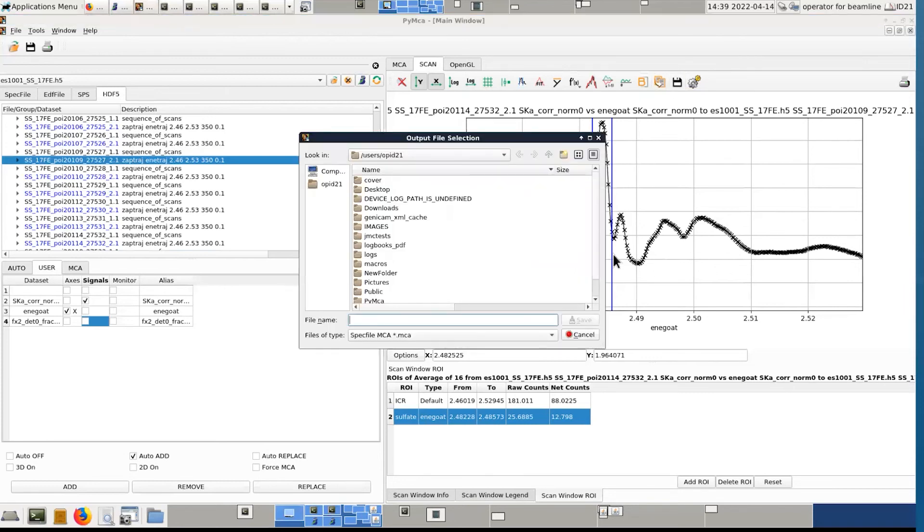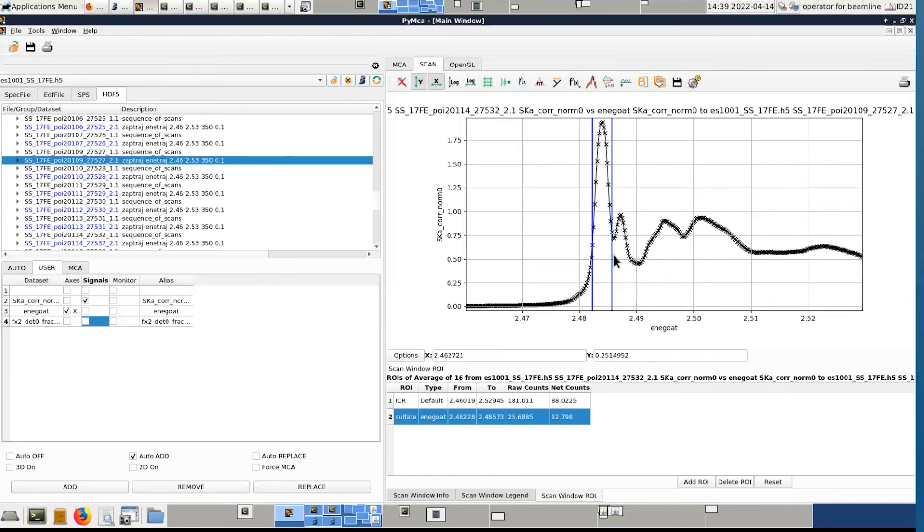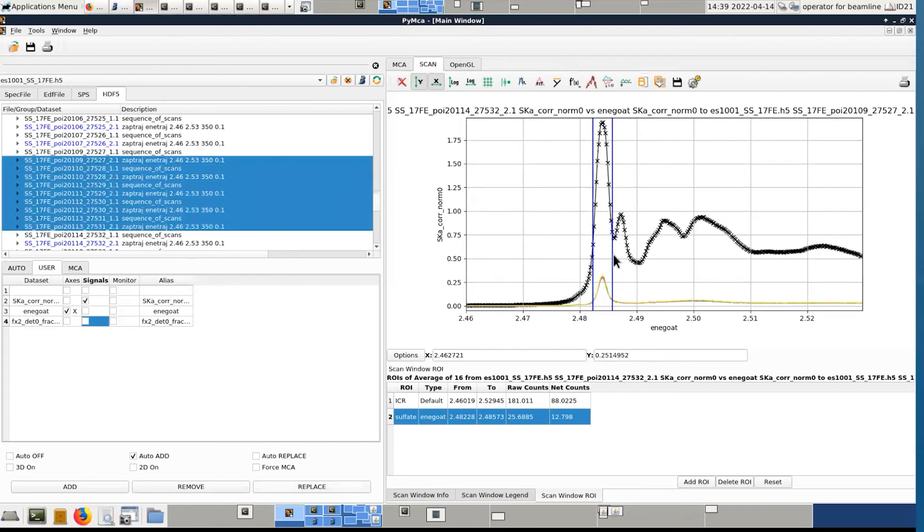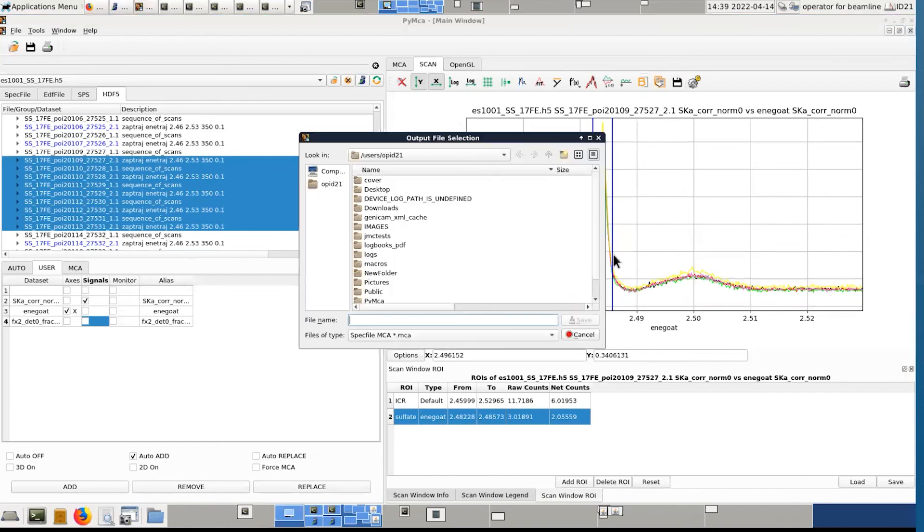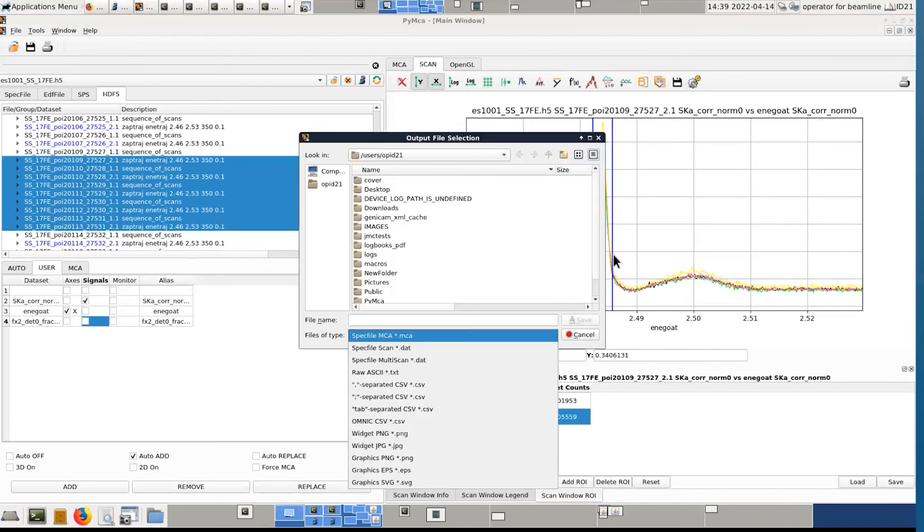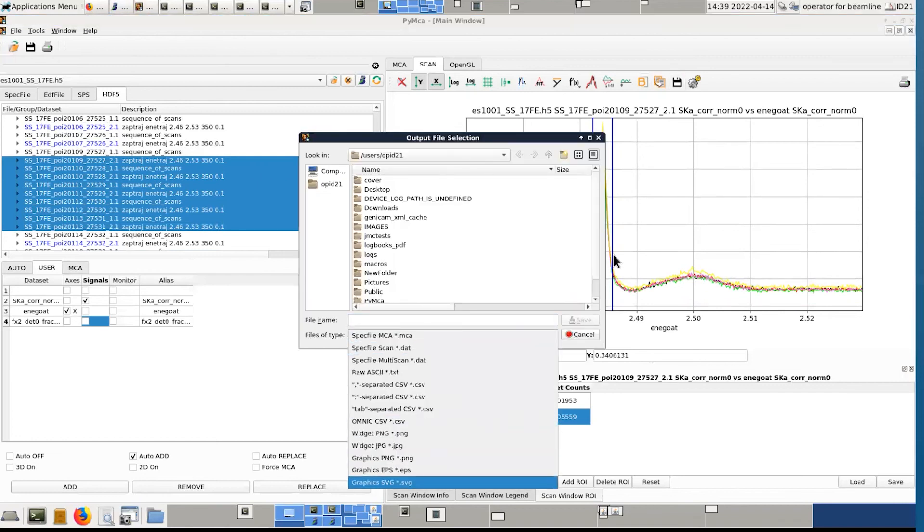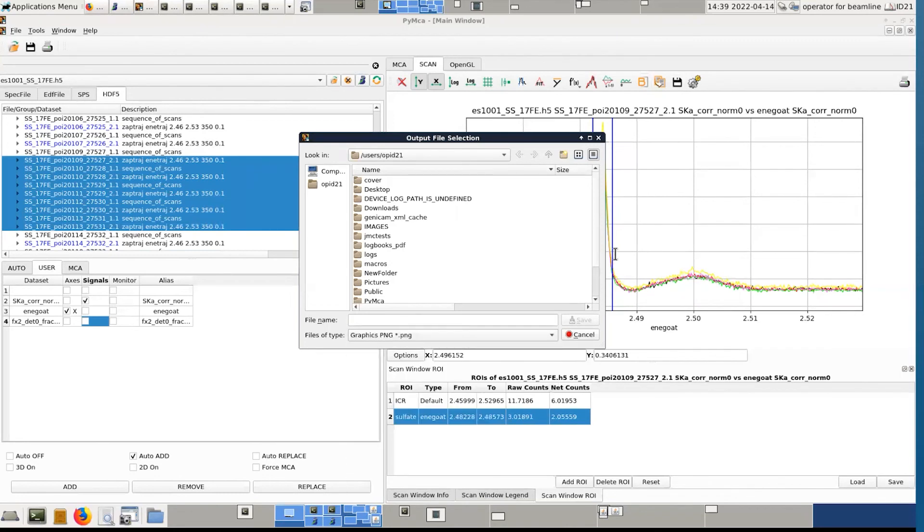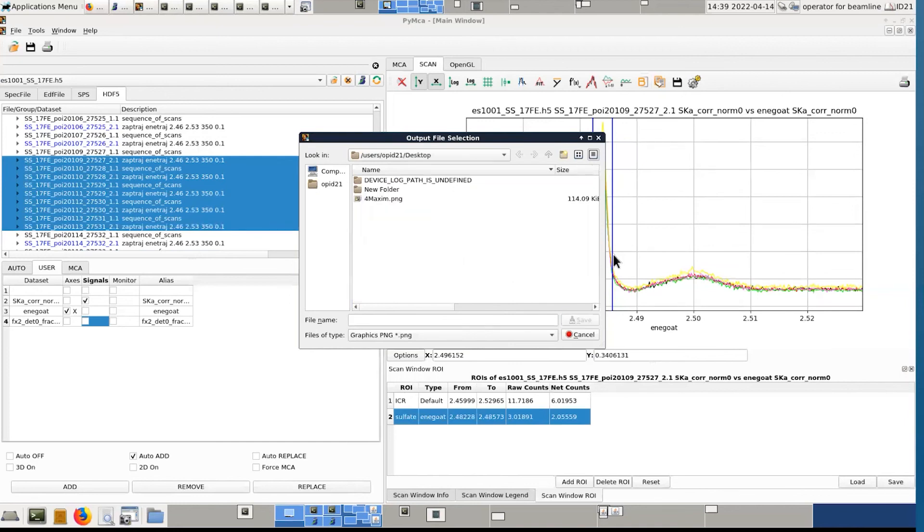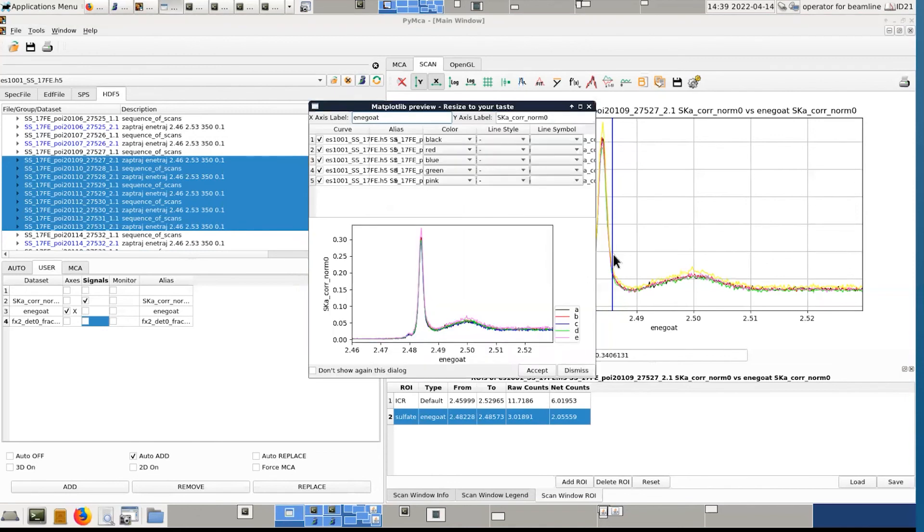This is the saving options. What is important is that, and maybe I should spend a few seconds on this one. So if I go here, you will find here options for graphics formats. And so if you want to export high quality graphics or XANES from PyMCA, you can go there. So maybe I can do. It's done.